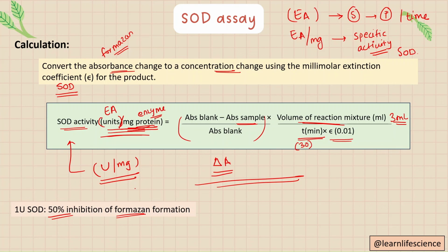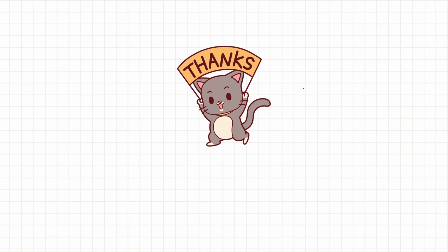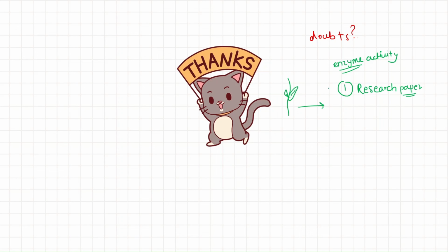Okay, I hope you understood the concept as well as the protocol and calculation. Still, if you have any kind of doubts, you can ask. Also one thing I needed to mention: if you are following a particular plant and you are carrying out experiments related to determination of enzyme activity, then it will be better to first go through different research papers related to your targeted plant.